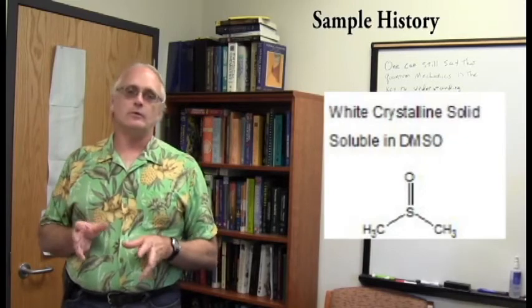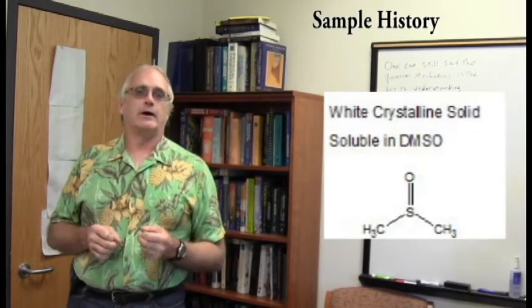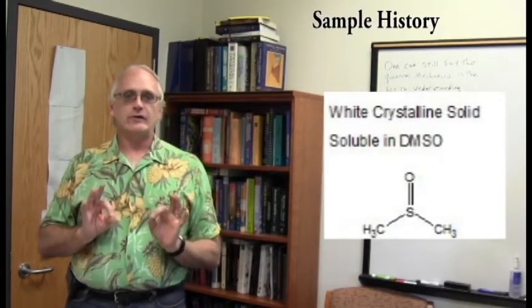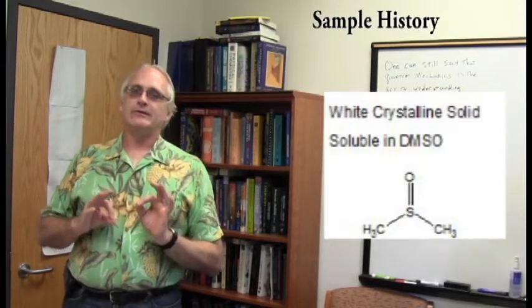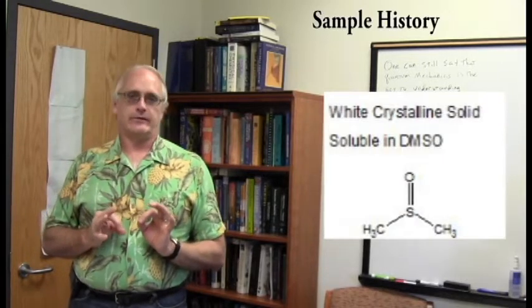Chloroform is polar, but it does not dissolve really polar hydrogen bonded compounds very well. So right off the bat, just by what solvent this stuff actually preferred to dissolve in, tells us, or gives us a clue, a little bit at least, about this compound.